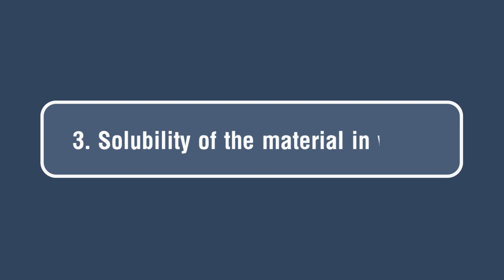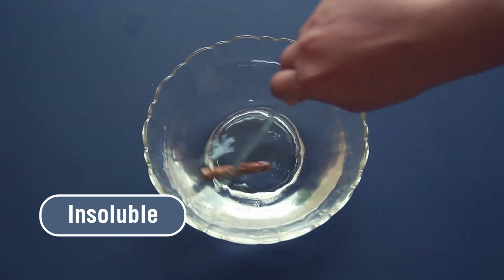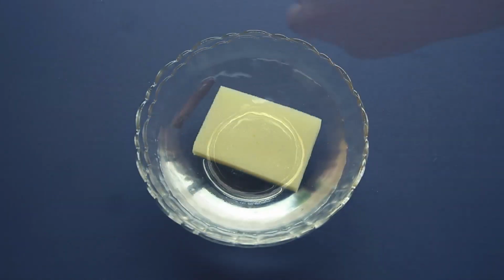Now let us check solubility of these materials in water. Stir the given materials with a glass rod and check its solubility in water.